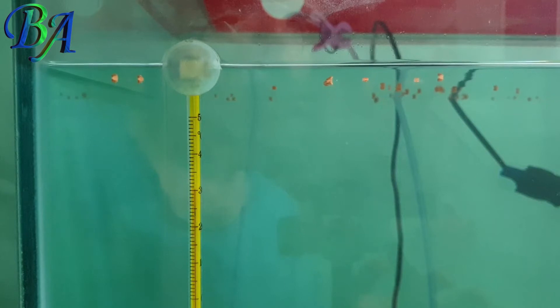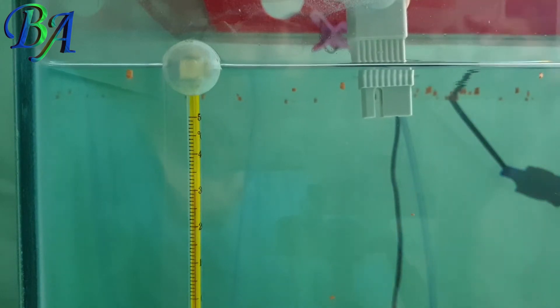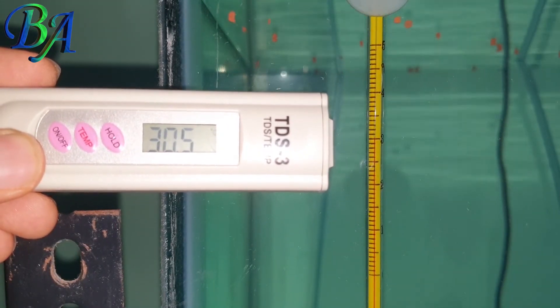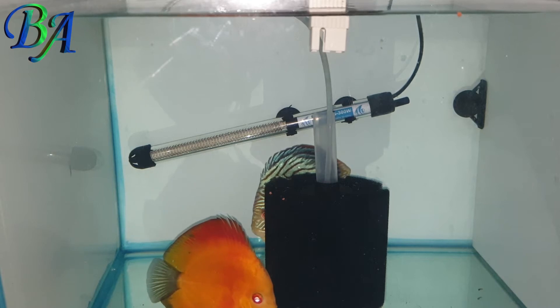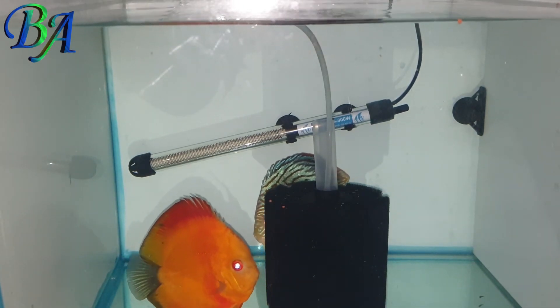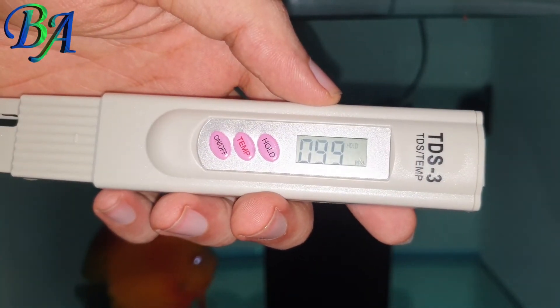Let's see if the temperature on the thermometer matches with the one on the meter — yes it does, so the temperature reading is also working. This is my discus breeding pair tank, in which the TDS should be between 50 to 100 for successful breeding. The TDS in this tank is 99, which is on the higher side.